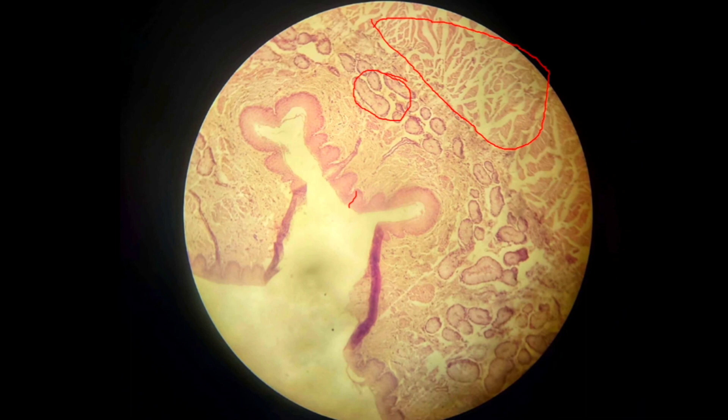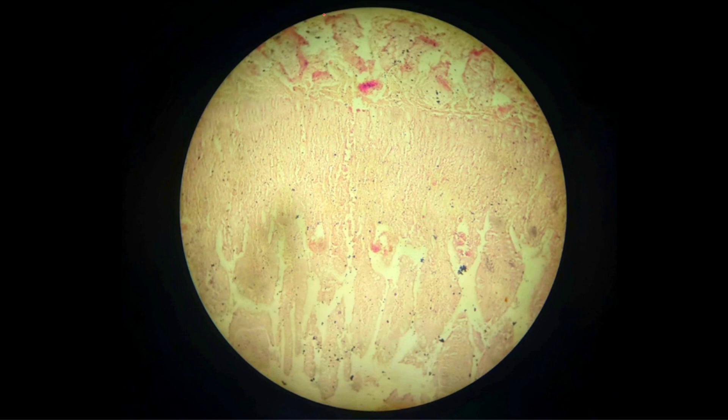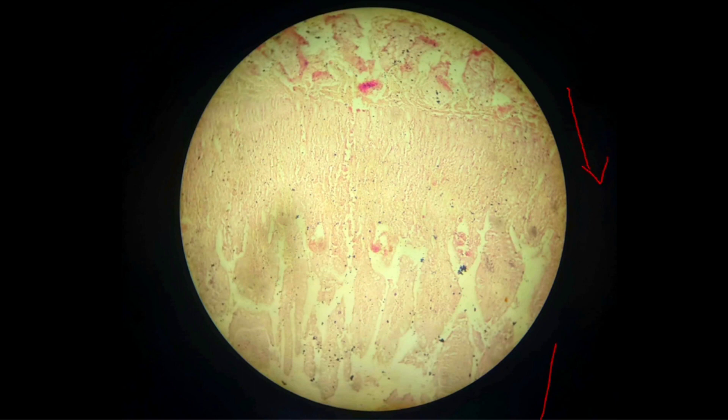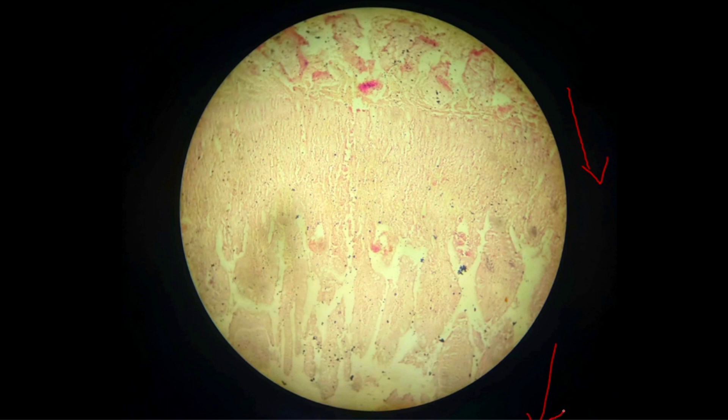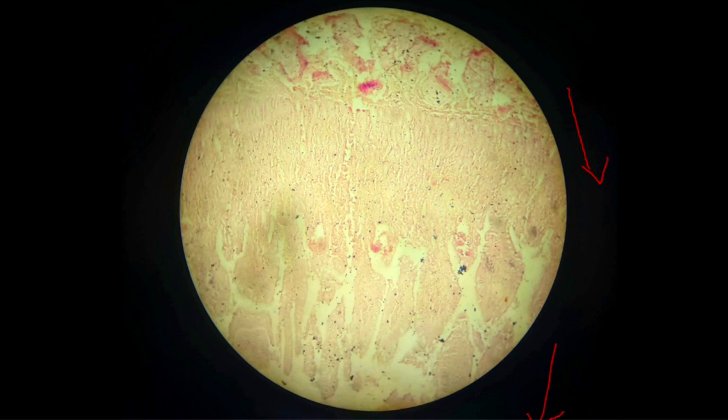This is another esophageal slide. This is the upper layer and this is the lower layer. What are these?